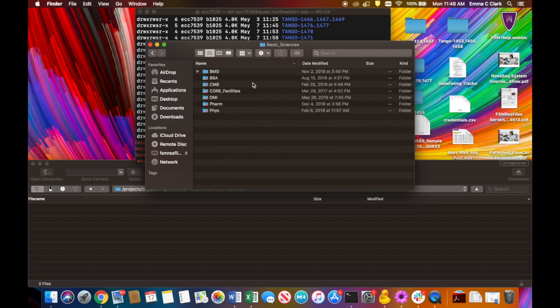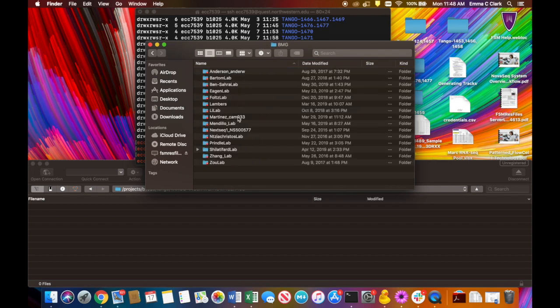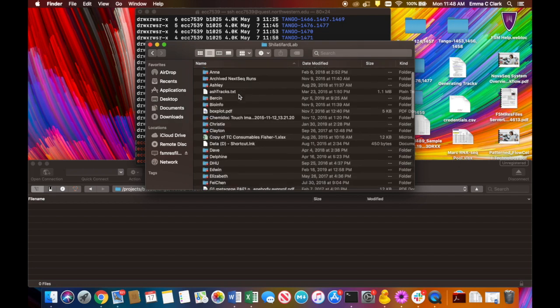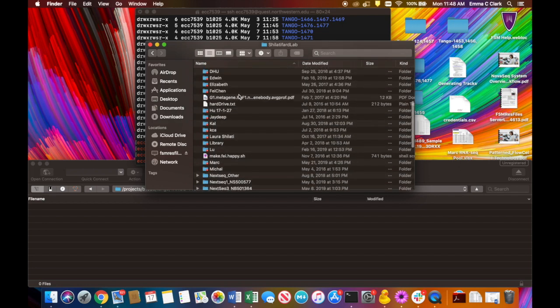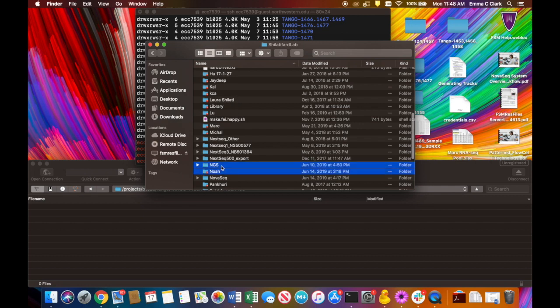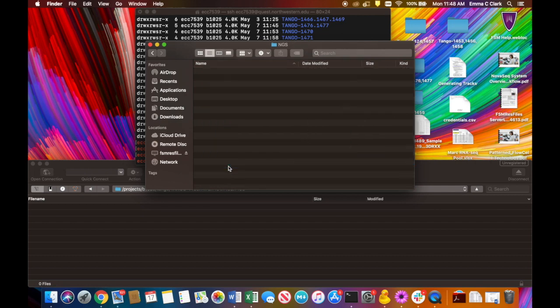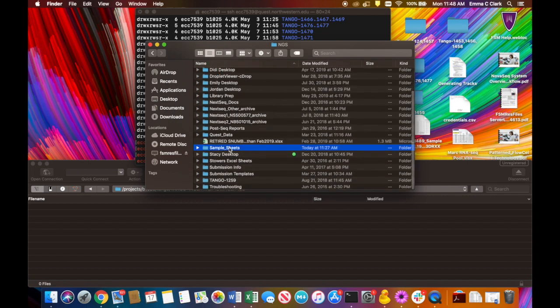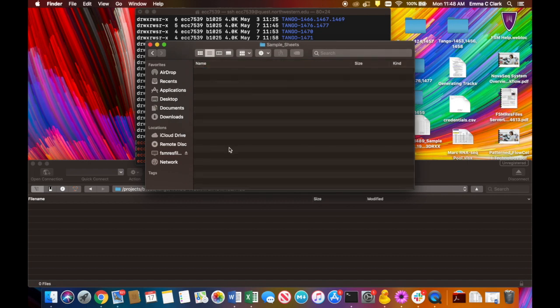And navigate to that folder that our sample sheets are in, because we're going to transfer the sample sheet that was created with all the files, with the index names, and all that different information, so that we can do the BCL to FASTQ and then the alignment and all those scripts and things like that. There's a lot of sample sheets, so sometimes it loads for a while.